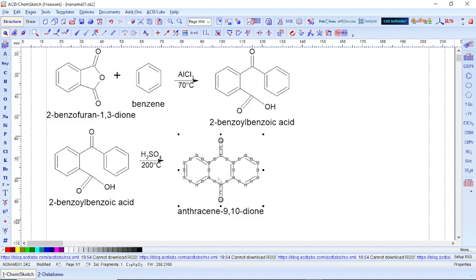You don't need all those things again. What you just need to do is, since this reaction is a two-step reaction, start with the last one. Start with the last stage to calculate your yield, or to calculate the amount of the reactant with an expected yield, whichever case.